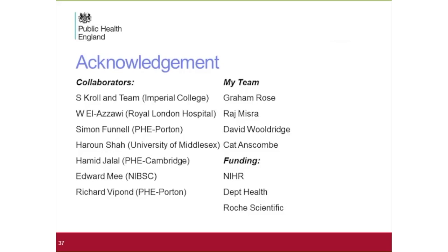In our view is that when the samples are collected, it is important to homogenize it and then split it into replicas immediately. Then these replicas are processed for the various lysis methodology. Ideally, lysis and extraction within 2 hours of collecting the samples provide the most consistent sets of yields. And once that is prepared, then the sample can be frozen rather than as a fresh sample that has just been collected.